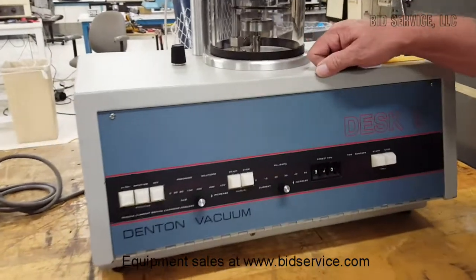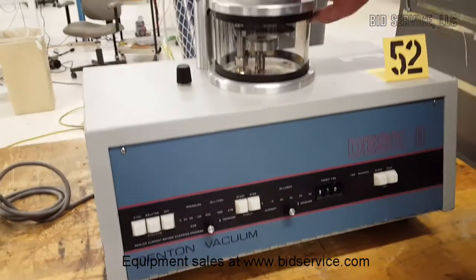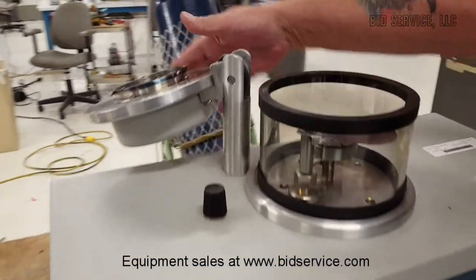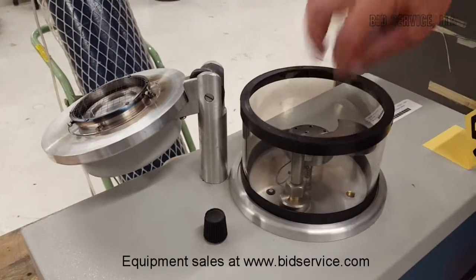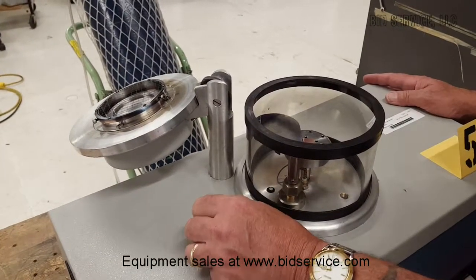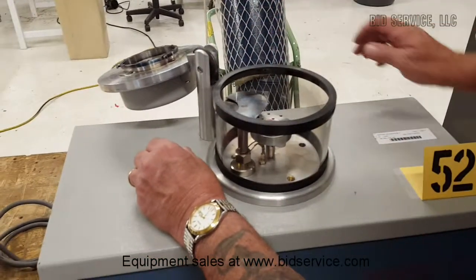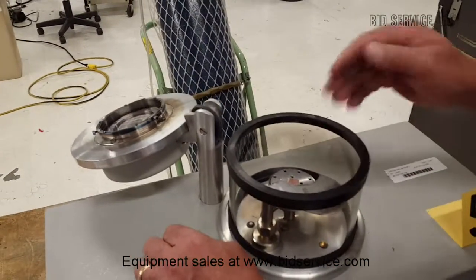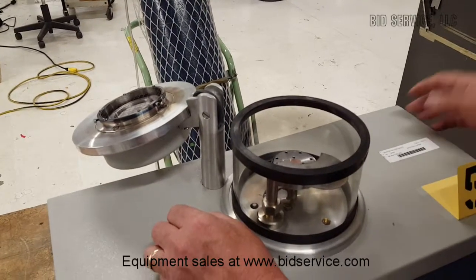This is the Denton Vacuum Desk 2. It's off right now, so we're able to open up the top lid. Right here is where your material would go, and you can see there's a shutter here. To close the shutter, go counter-clockwise. You can see the piece has fully opened up, and when you come back over, we've covered up the center. If you go this way, part of that folds back, and you can just leave it there and do your sputtering that way.